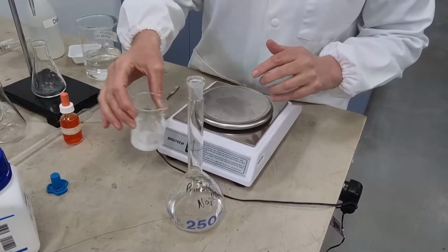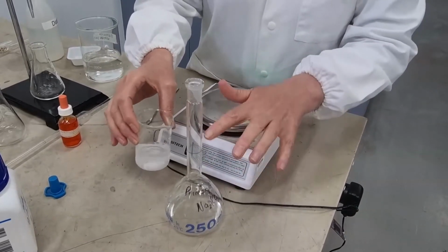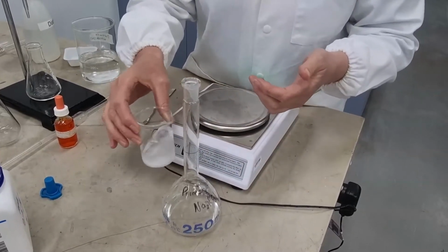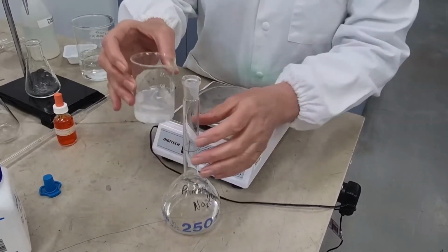Meniscus, we need to make sure it's all dissolved, because if we make the water up to there and there's still undissolved solid, then when it dissolves, the volume will change. So you have to make sure it's dissolved first.